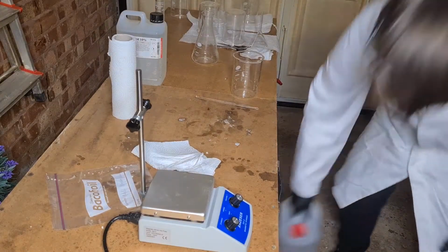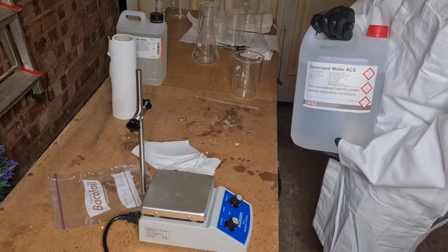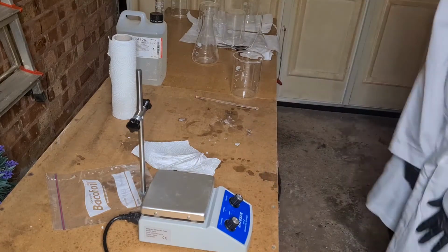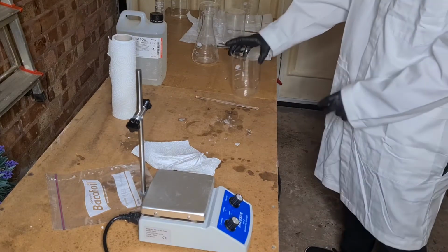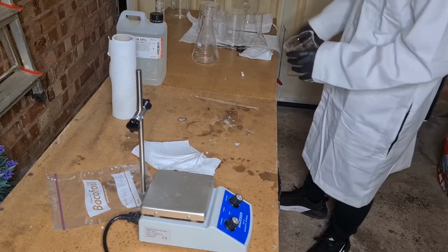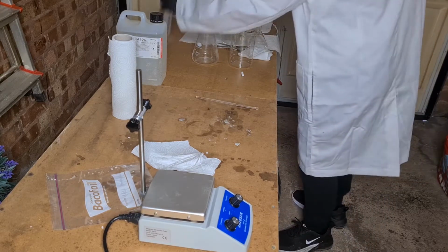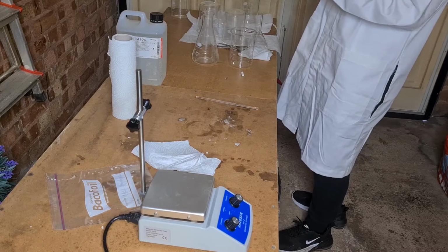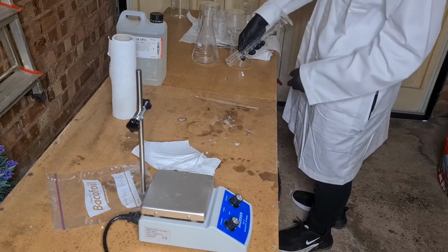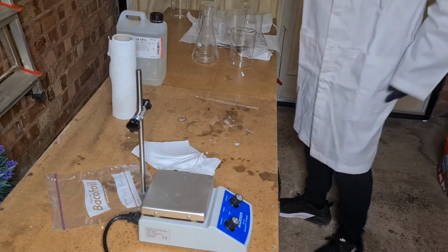We also have deionized water, because distilled water was, well, it was more expensive. So, just put that back down there, because we don't need it right now. We have some beakers, many beakers. Some of them were being washed from when I failed to make it the first time. And we've got a measuring cylinder, which still has some sodium bicarbonate on the outside, but the inside should be fine. I'll just pour that out on the desk. It's water. It's fine. I neutralised any acid that I used last time.